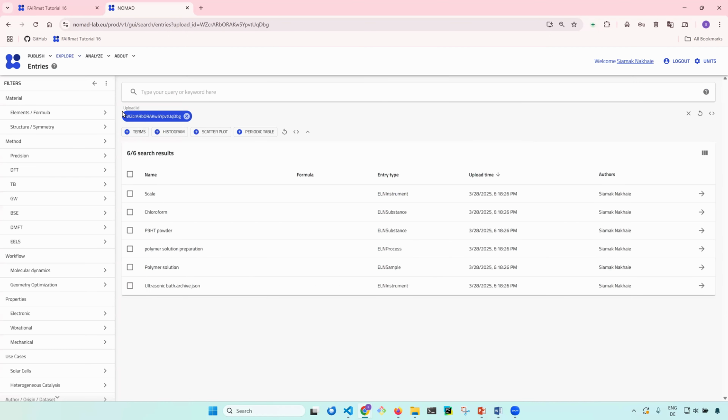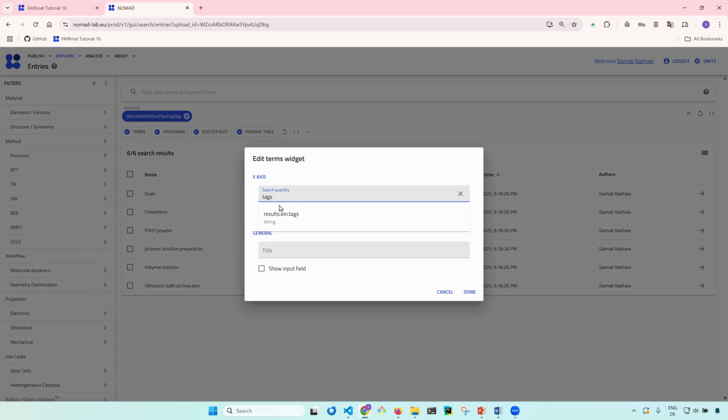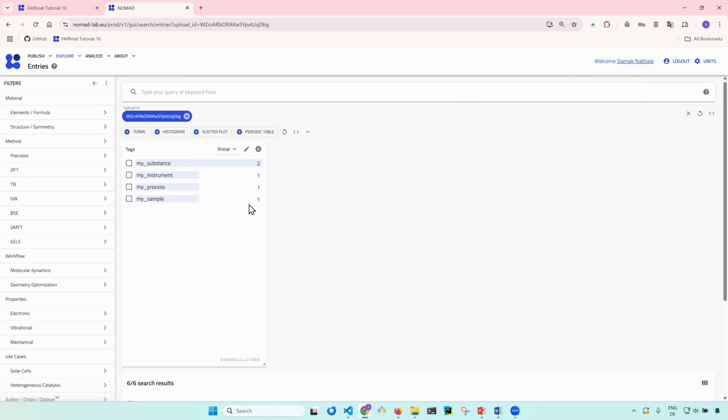So this is basically the upload ID that I have. So only the entries in this upload are being shown. And I come to this terms, search for tags, and then this is suggested by Nomad. I click on it, and now I can see that I made two entries with the tag my substance.